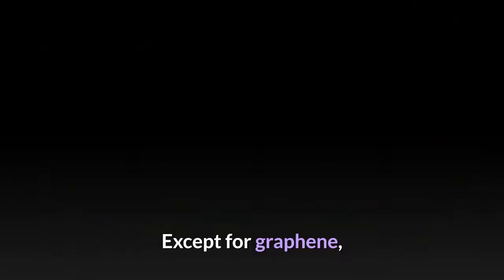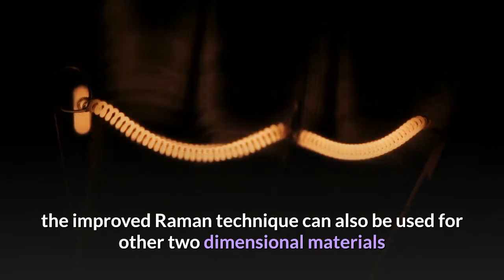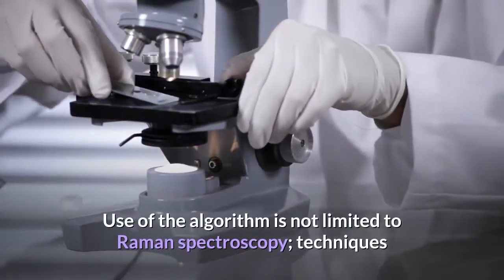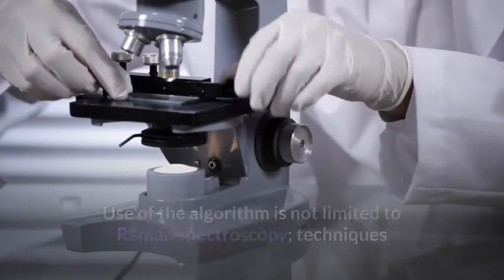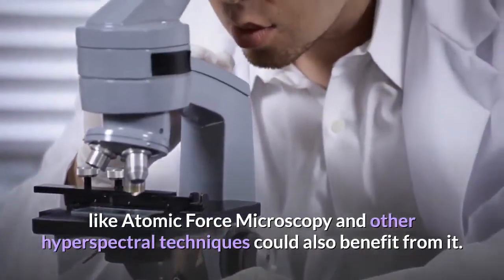Multi-purpose. Except for graphene, the improved Raman technique can also be used for other two-dimensional materials like germanene, silicene, molybdenum disulfide, tungsten disulfide and boron nitride. Use of the algorithm is not limited to Raman spectroscopy. Techniques like atomic force microscopy and other hyperspectral techniques could also benefit from it.